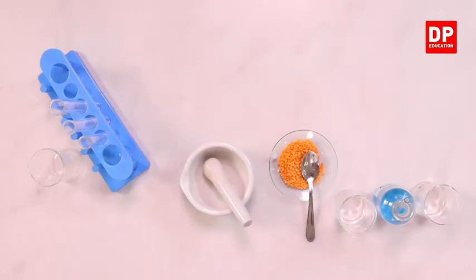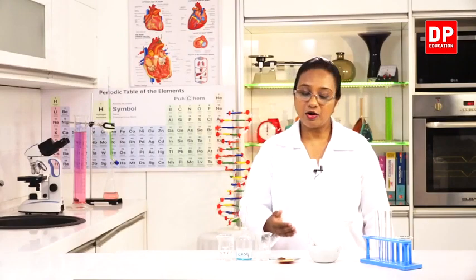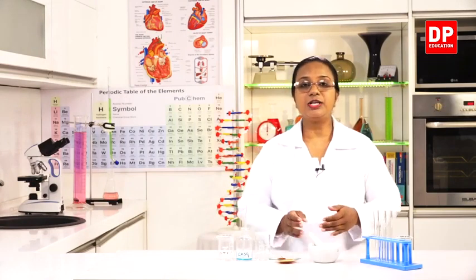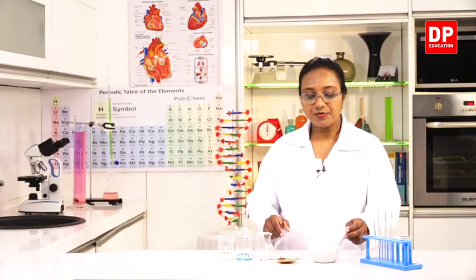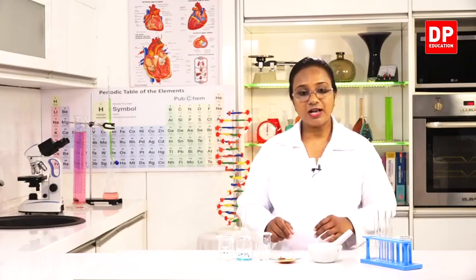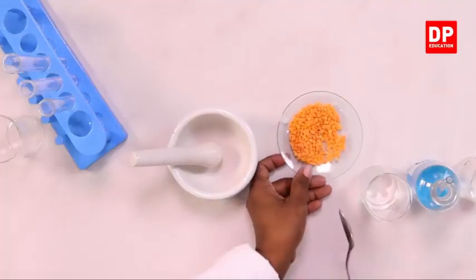Since dal is a solid substance, we will have to get an extract of the dal. For that, I will need a mortar and a pestle. First, I am going to transfer a small amount of dal into the mortar and pestle.